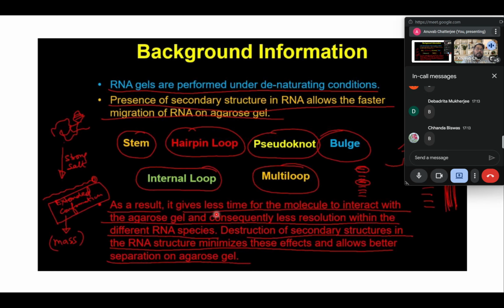This is also very commonly observed with plasmids. So plasmids, we know, are these circular double-stranded independently replicating DNA fragments that are present in bacteria that contain antibiotic resistance and tons of different other things. They also come in three different secondary structures. One, a normal circular structure that you like to see and that always travels at the correct size that it should.